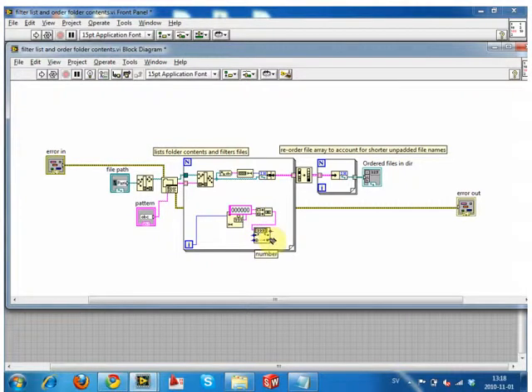If we use this number as a file name rather than using just the I value, then we've essentially solved our numbering issue. It is now going to number them in exactly the right order, because we have a whole bunch of zeros to start with. We're not starting with 1.